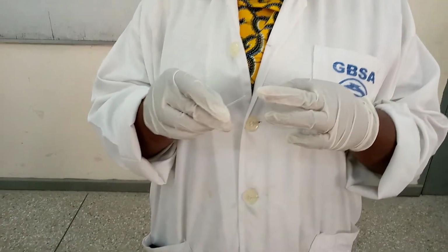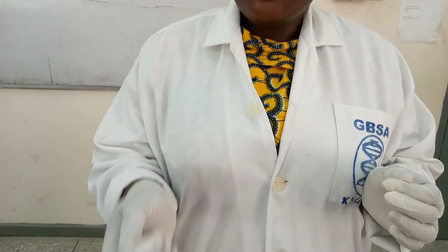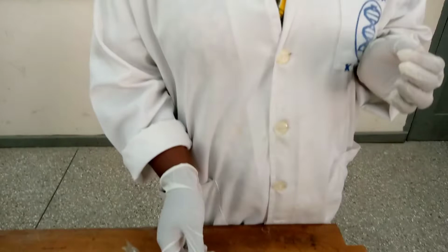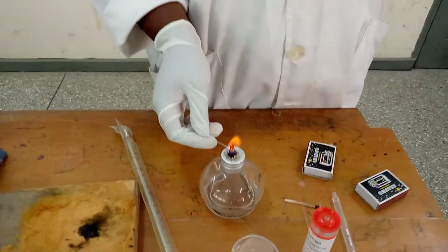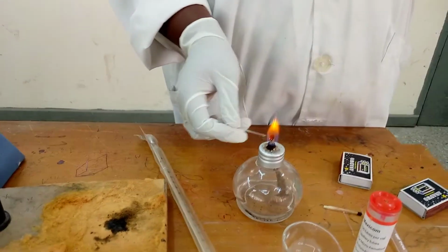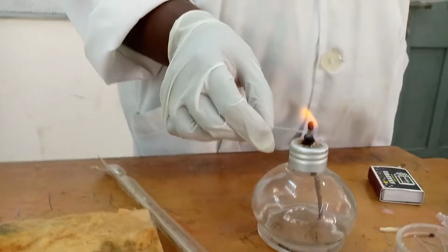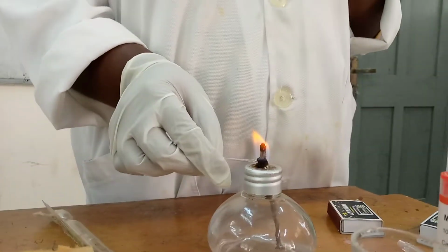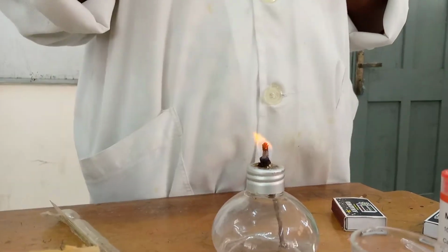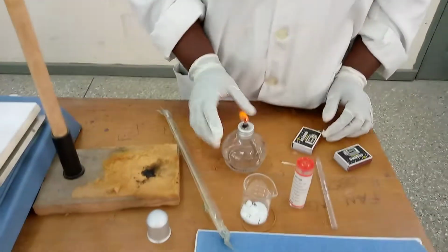So as it melts, one end will seal, but if you check and it's still open, all you have to do is send it to the blue flame for it to melt. So as it melts, it will close one end. So that is how we seal the capillary tube. Okay, so it's sealed. So this is how we seal it. After that, you put off the flame.